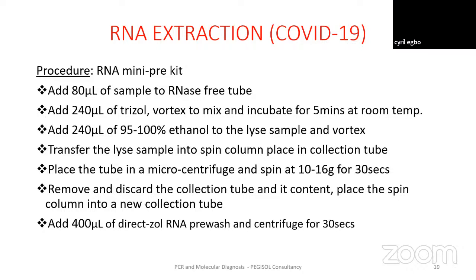Then for RNA extraction, for instance, during the pandemic, COVID-19 is an RNA virus. The procedure is just like extracting DNA from a swab or buccal swab. For a buccal swab, for instance, you use a swab stick to scrape the inner cheek of the mouth.